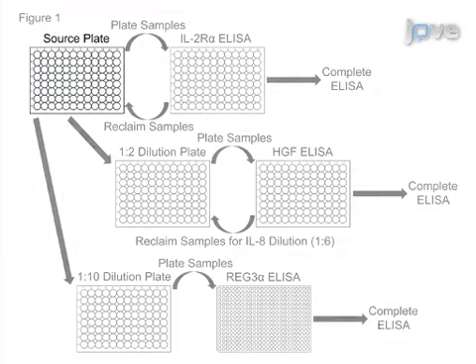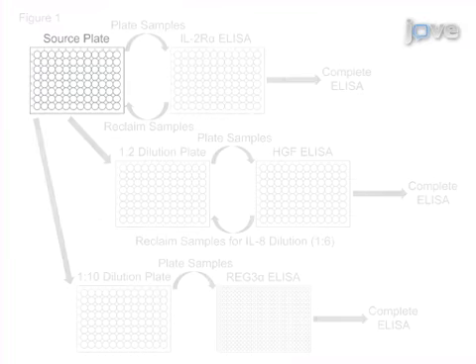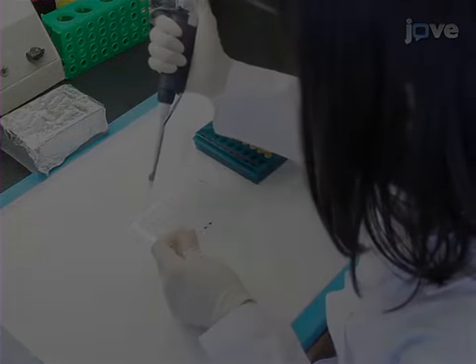Then, plate 150 microliters of undiluted plasma from each sample onto a 96-well V-bottom plate by manual pipetting according to predefined maps.